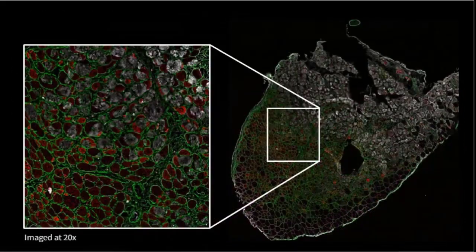And of course, the resolution of the image is maintained. Because all the translation and stitching is done at subpixel resolution, you can see that the image is just as high quality and sharp as before, unlike with other algorithms, where translation at subpixel resolution normally requires interpolation and blending.